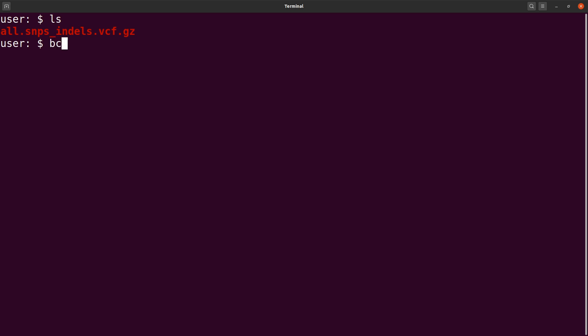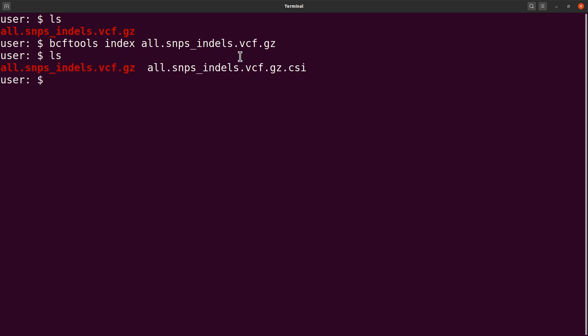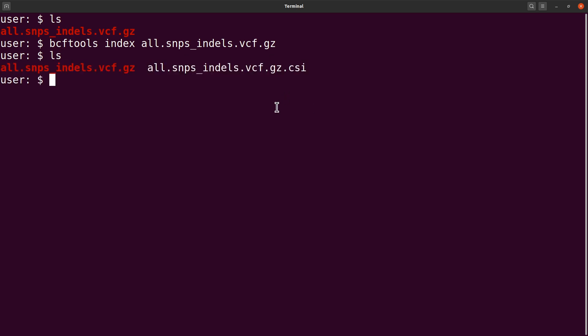We will begin with the first type, which is CSI. We say bcftools index and we specify the VCF file. By default, bcftools generates the CSI formatted index files, so we don't need to specify any option in this command. This is what we need. Let's run it. That is done. Do an ls and you will find that the file has been generated. This is the CSI format.